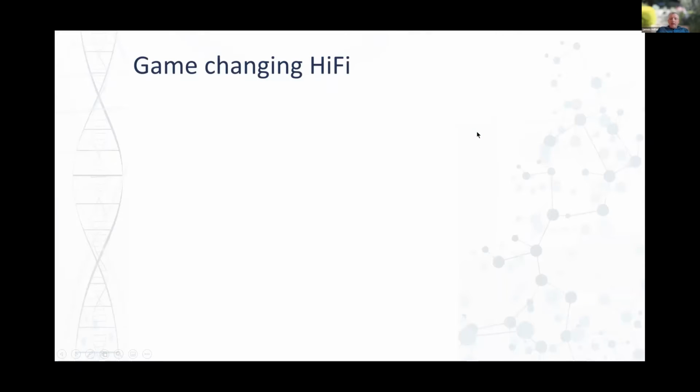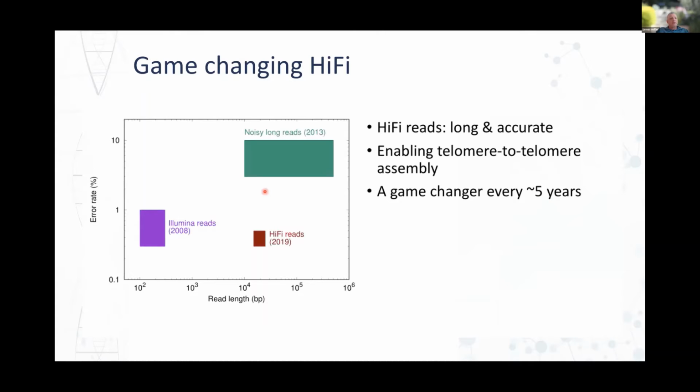So as Paul mentioned, we've talked a lot about HiFi, and we are now hearing a lot of people refer to HiFi as game-changing technology. This slide came from a researcher in the US, Heng Li, who pointed out that in 2008, Illumina short reads came along, and then about 5 years after that, we had noisy long reads, ONT and PacBio reads, which were somewhat of a game changer, allowing a lot of interesting things to be done with single molecule long read sequencing.